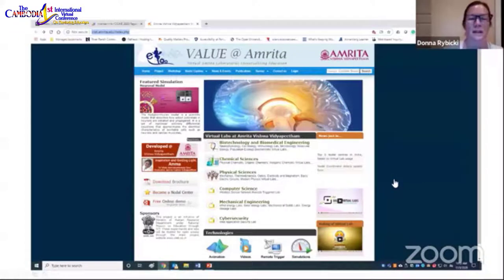Okay, thank you, Esperanza. This is one of the websites that I use for my online chemistry class. I really like Amrita. They have a lot of websites. And actually, what Esperanza is showing you right here in the middle, when you click on chemical sciences, it's going to give you other options. It'll give you an option to look for physical chemistry labs, organic chemistry labs, and inorganic or advanced analytical chemistry. And these are all online labs.